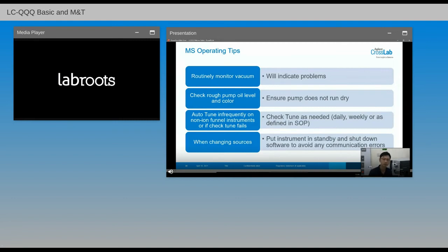This brings the temperature down to a much lower level whereby you can handle the internals, because it's hot. When you open up the spray chamber, you will know it feels not only warm, it's hot. You have to put safety as first priority. And the next thing is that you have to shut down the electronics.